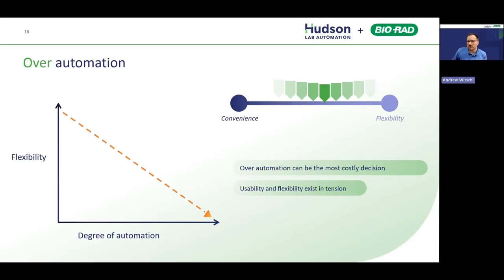So thinking about this trade-off when you're rolling out automation, it drives you towards deliberate automation, but also towards more smaller modular automation, right? Because that gives you a higher degree of reuse. So rather than thinking about everything as process automation, you really want to focus on the tools, the workflows, how you can reuse those because those help you maintain flexibility in your lab. And ultimately, you can bring those together for a higher degree of automation, but that's not always the right step.